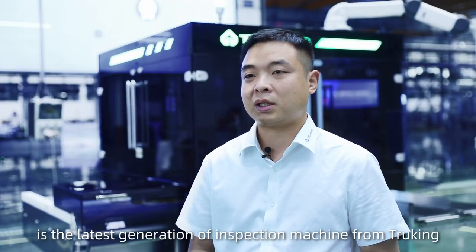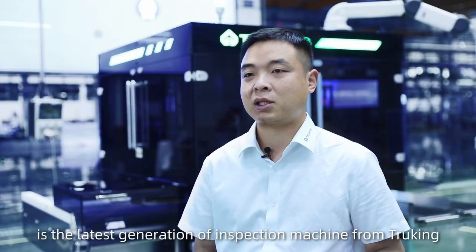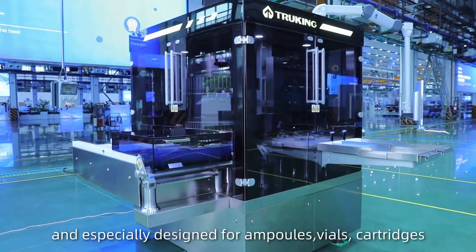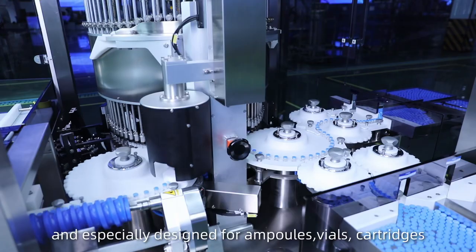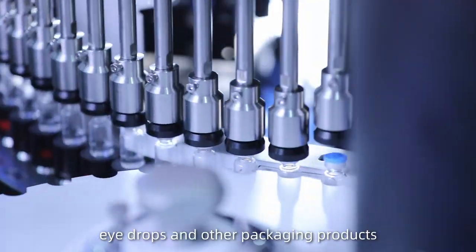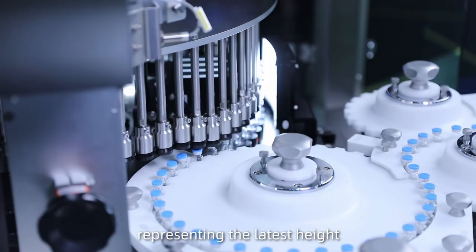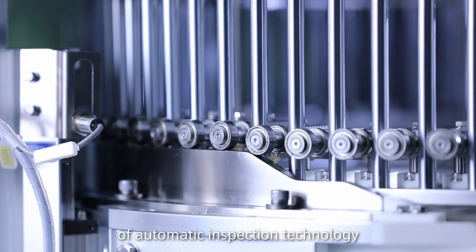AIM 72 is the latest generation of inspection machine from Truking, and is specially designed for ampoules, vials, cartridges, eye drops, and other packaging products, representing the latest height of automatic inspection technology.